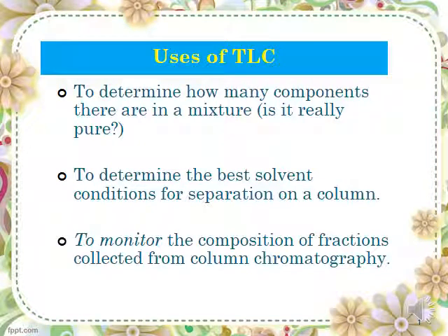Okay, TLC. What is the use of TLC? Thin layer chromatography helps us to determine how many components are there in the mixture. Another way is to identify purity, how pure each of the components in the mixture is. Secondly, it enables us to determine the best solvent condition for separation if we use a column. And thirdly, it is used to monitor the composition of fractions collected from column chromatography.